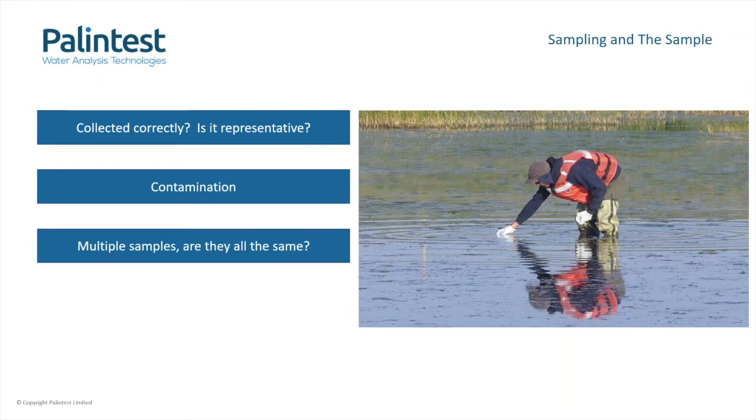When taking more than one sample, it can sometimes be difficult to collect two samples that are the same. An effluent stream is a good example of this. Sometimes a sample sent to a lab will be treated differently to the one tested there and then on the photometer. The extra time taken to process the lab sample may have allowed the sample to change.